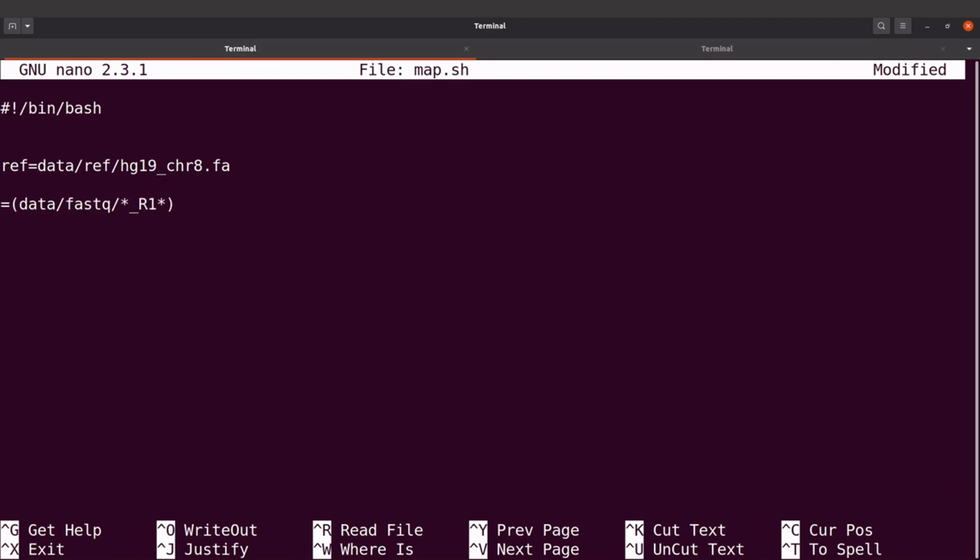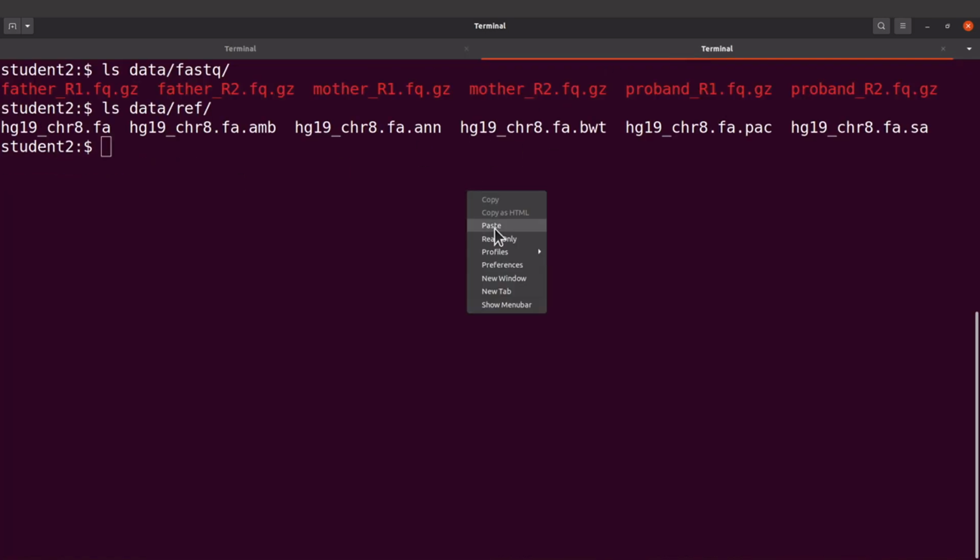Let me put it here. So I'll say forward reads. I am using forward and R1 interchangeably. Okay, so forward or R1 means the same thing. So take note of that. So these are the forward reads. Let me just change this. Let me just use one word. Let me combine it: forward_reads. So this is what we have here. I will just copy it to this terminal just so that you see what I'm talking about. So I'll just paste it here.